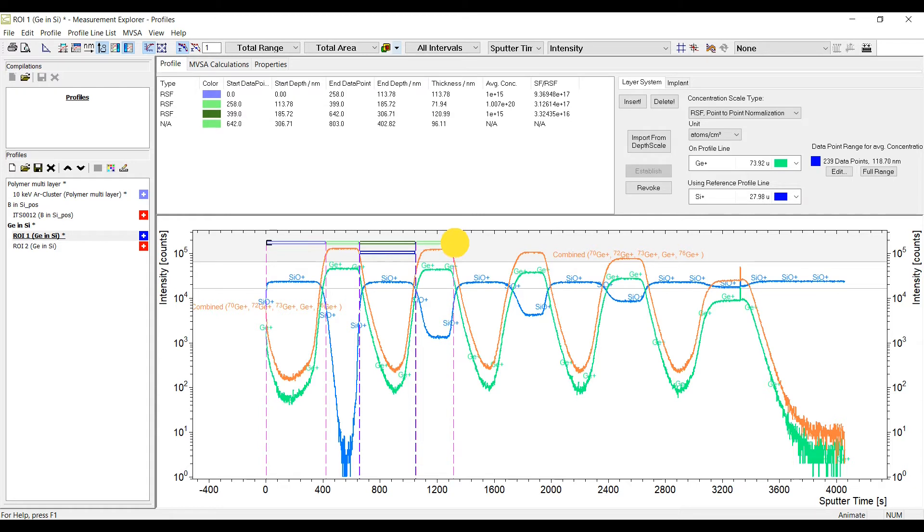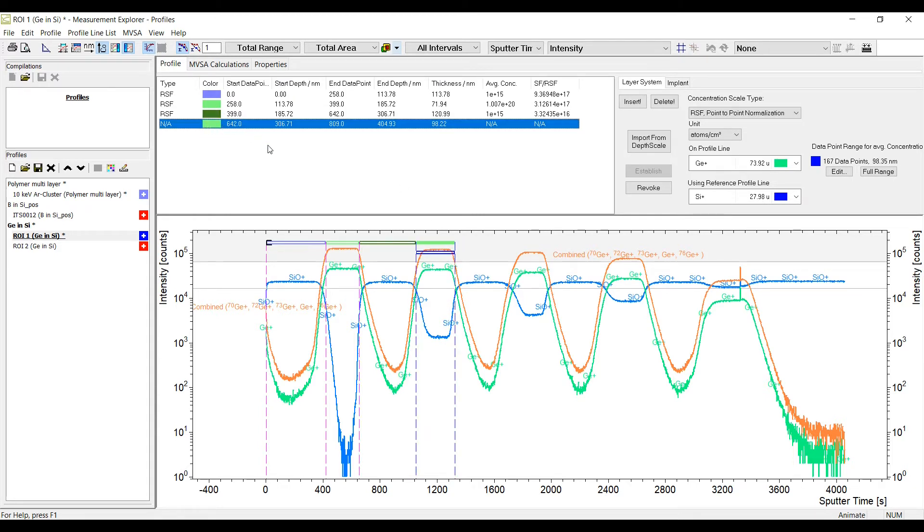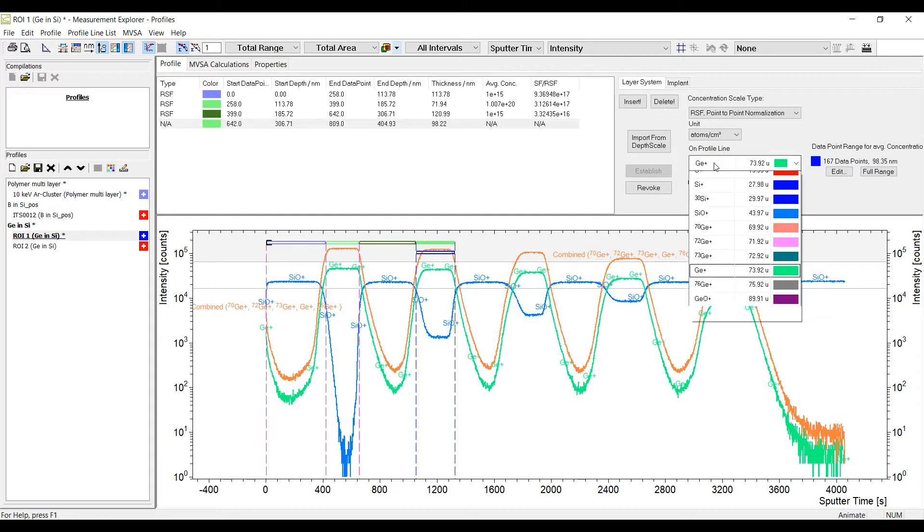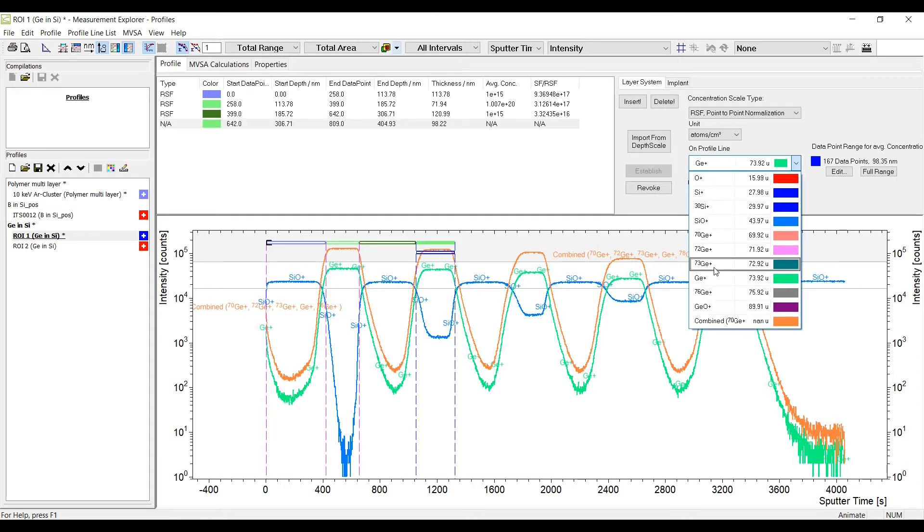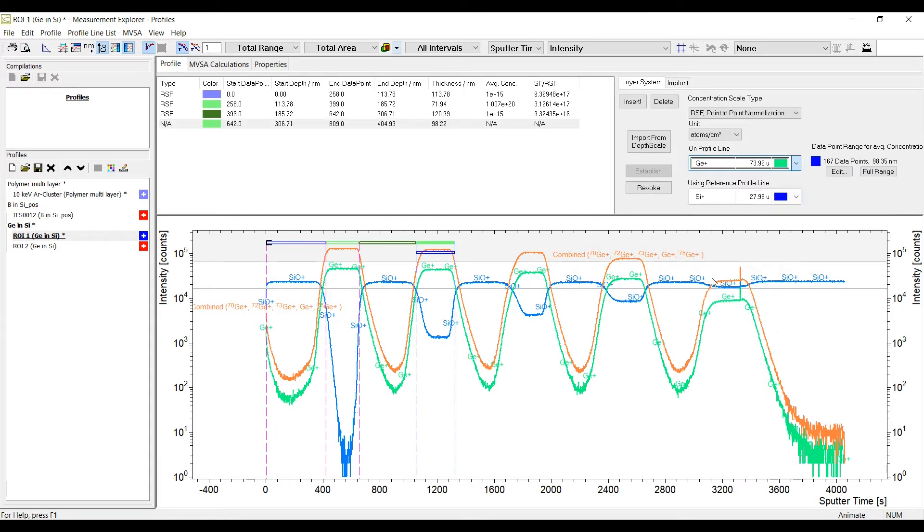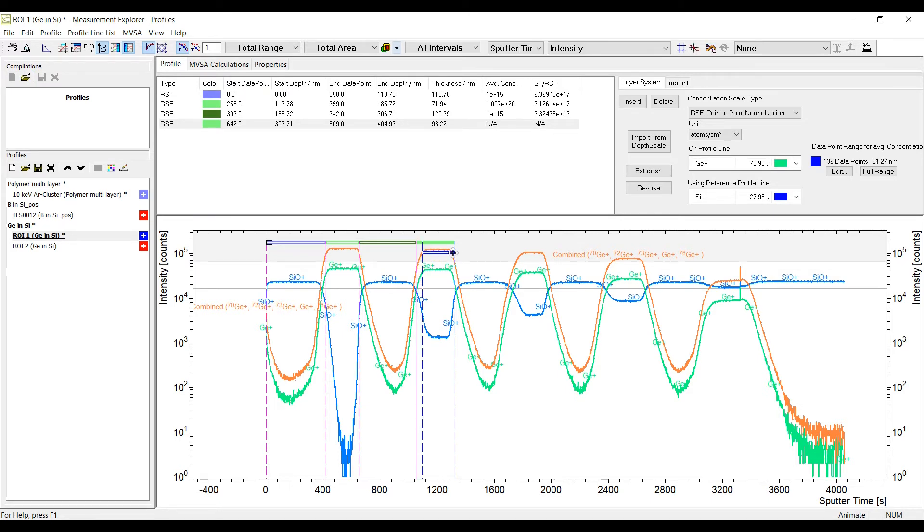The entire profile can be divided into layers. Typically, these sections represent different layers with different chemistry. So, the calibration method as well as the reference profile line might be different in each section. With CTRL, SHIFT, LEFT mouse click you can add layers to your profile.